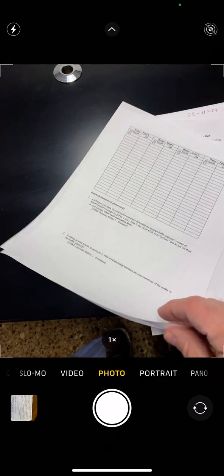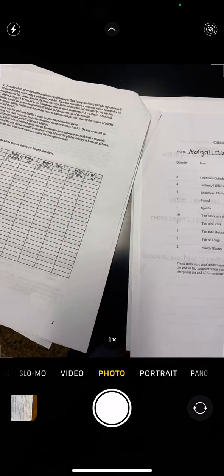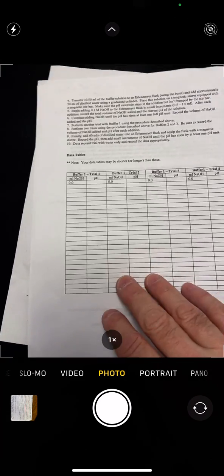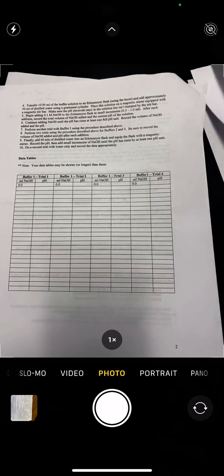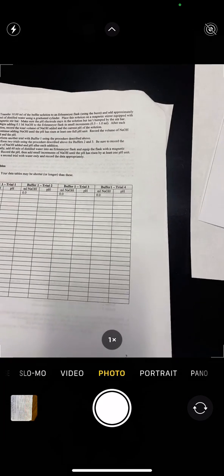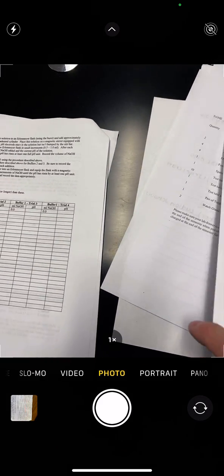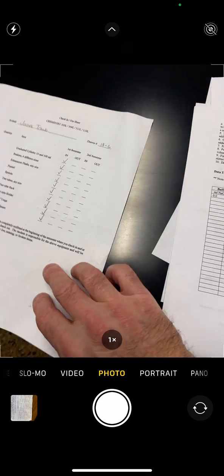We have these data tables to fill out. I have data from students. So you are going to be filling out trial number 1, and then we will get the last trial from student data. Dang, I don't have that page. No, I don't. So you will have trial 1 for comparison.